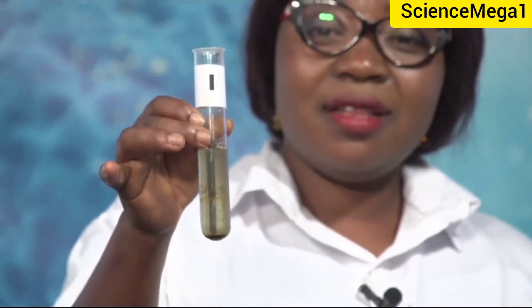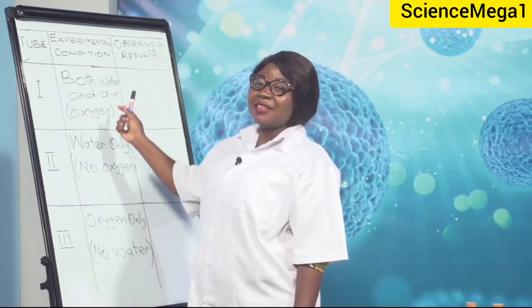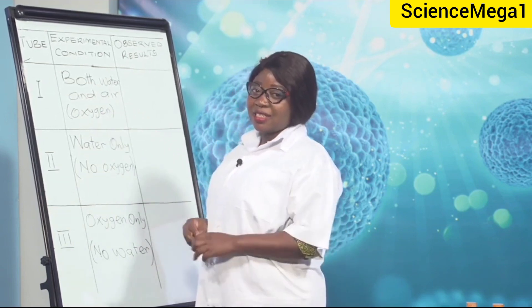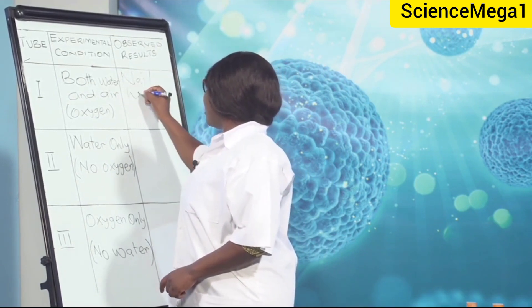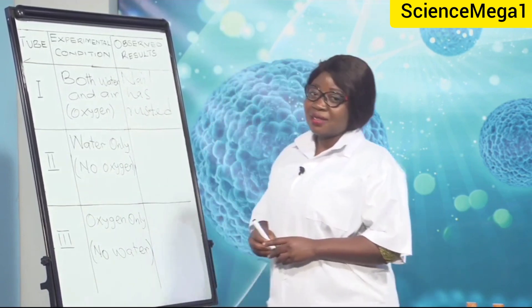Welcome back to the lab. Let's observe the outcome of the investigation and complete the table. The nail in test tube one has rusted — you can see the reddish-brown stain on the nail. The nail in test tube one was subjected to both water and air or oxygen, and therefore it has rusted.